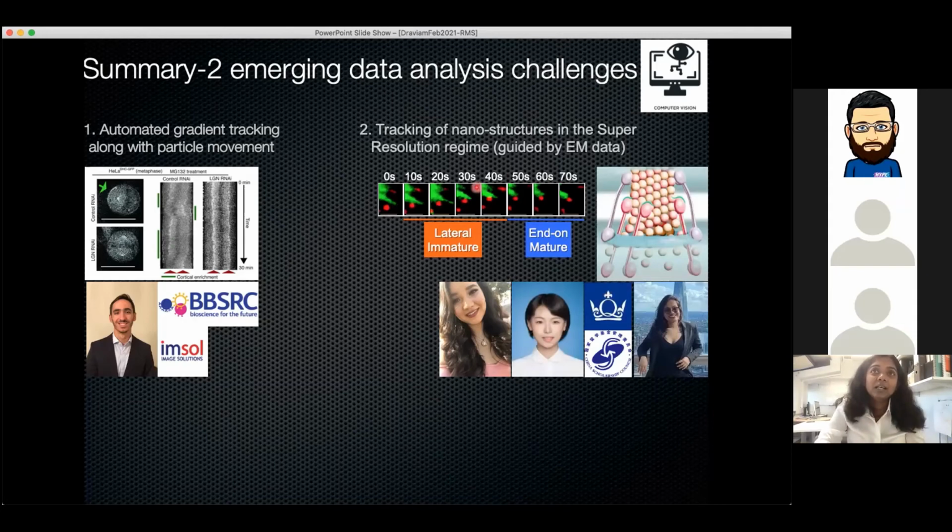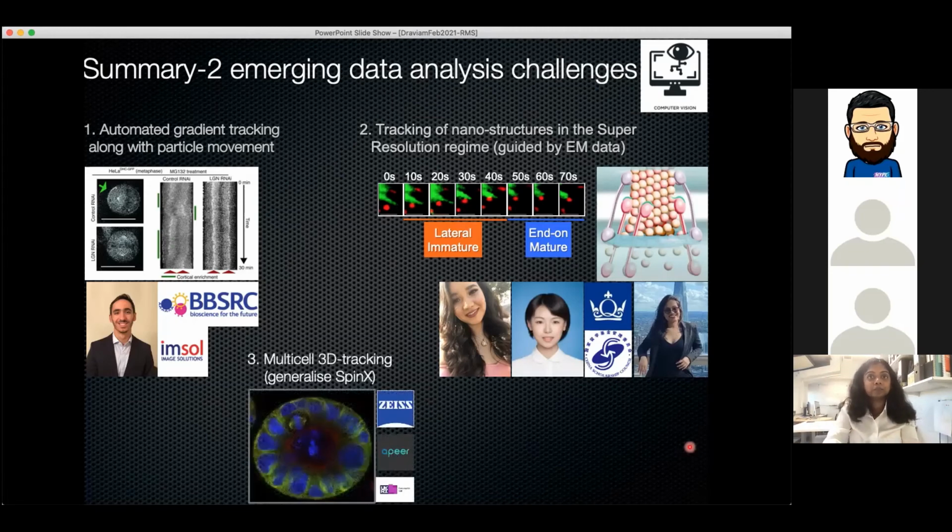And the end-on conversion process is really fantastic for that, because the kinetochores are moving from a laterally attached state to an end-on attached state. During the process, this large submicron structure undergoes dramatic changes in its structure, and we want to be able to visualize this. At the moment, Catalina, Sinong, and Sanji are all focused on understanding how kinetochore changes are driven in cells.